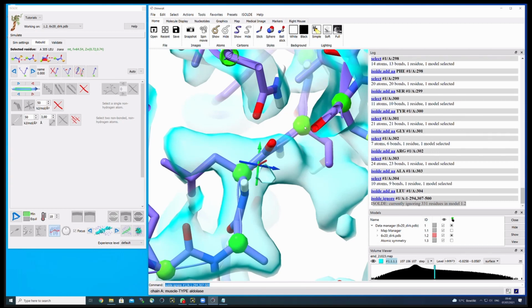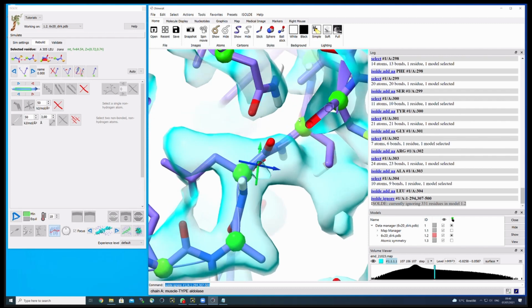But then eventually you spot one problematic area once you have assembled everything, and now you want to change this in all the 24 of them. So you can either change it in one and copy paste again, or you can use what I'm doing now.